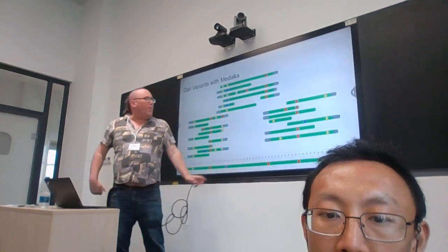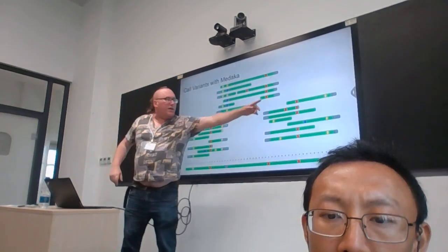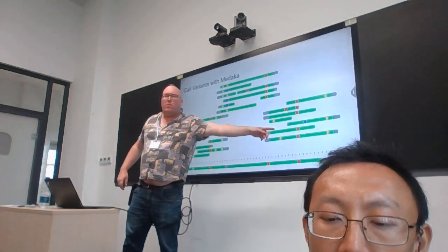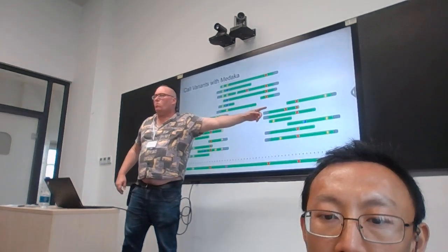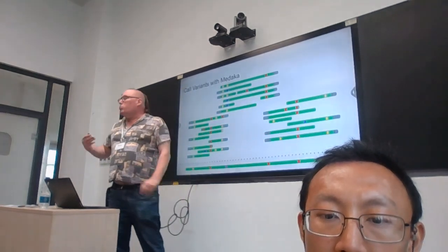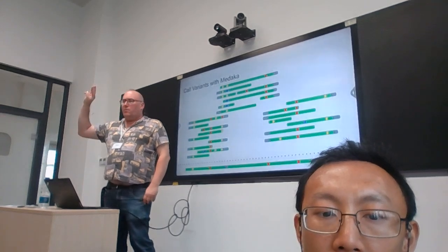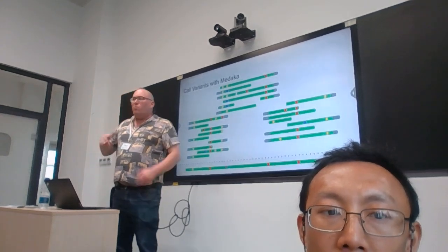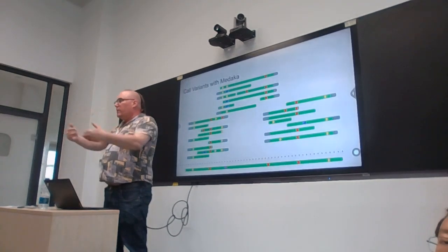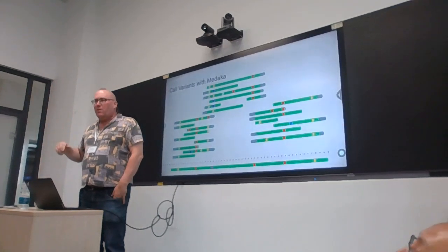But, look, this is obviously made up data. But what is my depth? The yellow variant over there, what is my depth? What is the depth of that yellow variant at the end? How many reads are supporting that position? 3, right? So in this simulated data. Normally what we say in our real data is that we want depth at least 10.